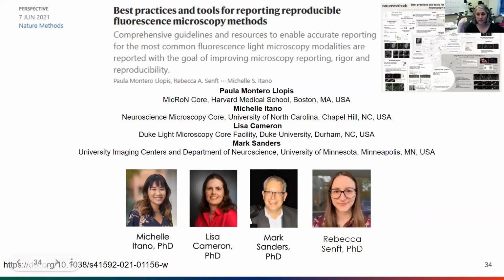Everyone included in this group is an educator. We run core facilities that are really focused on supporting our users. What we have noticed throughout the years is that the main reason people don't do good methods reporting in light microscopy is not because they are lazy or don't want to, but because in most cases they don't really understand what needs to be included and why it is important.